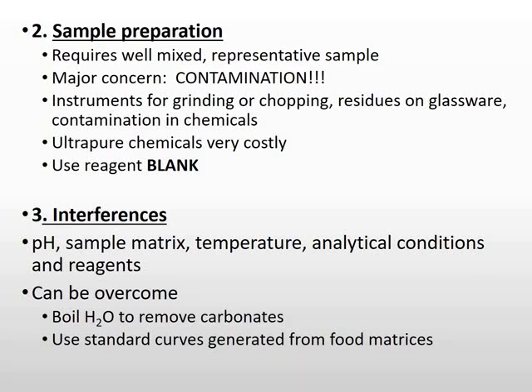After taking the representative sample, then you have to do the grinding and the chopping, making sure that you reduce the particle size, because remember we mentioned that those analytes or minerals are found within the matrix of the food, embedded inside. So for you to be able to do the extraction, you must make sure that you reduce the particle size.